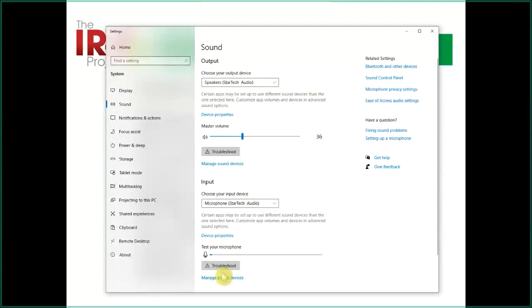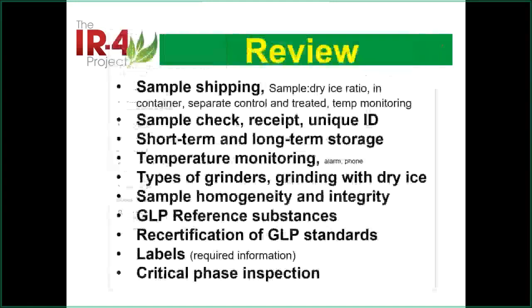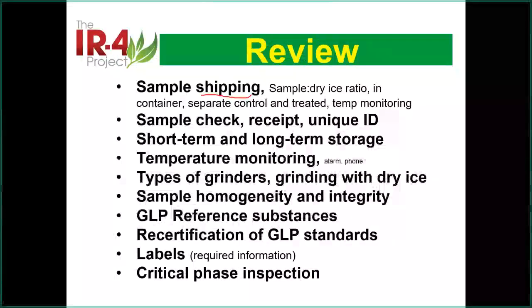But if you are not part of the lab, you need to freeze your sample in your freezer, and you send the frozen samples to the lab. Okay, so in this case, the shipping sometimes depends. I was in some countries where the traffic, even within the city, takes like 2 hours. So that's a big issue there. So you do need to do that.